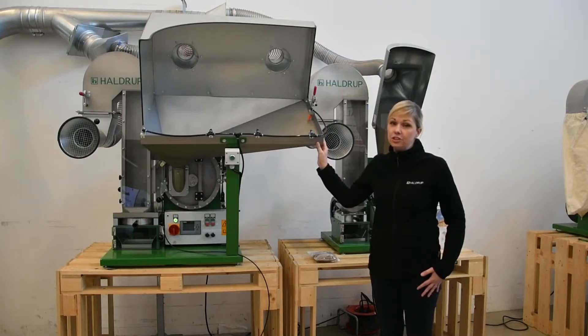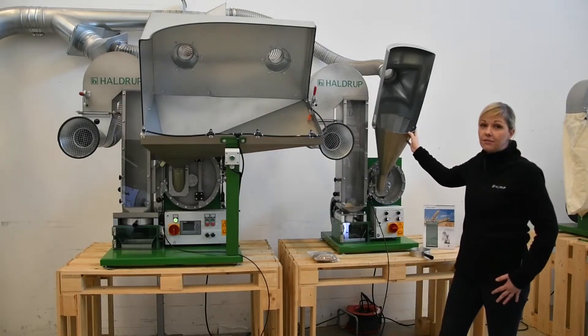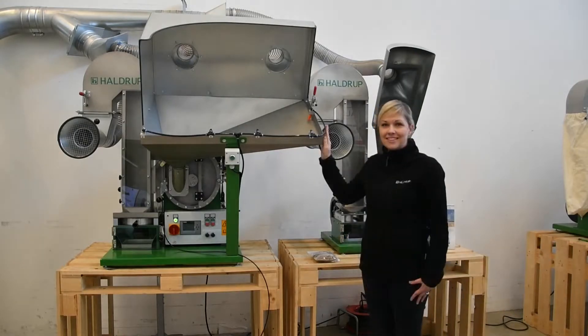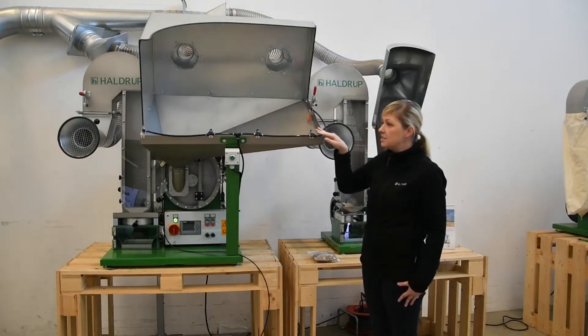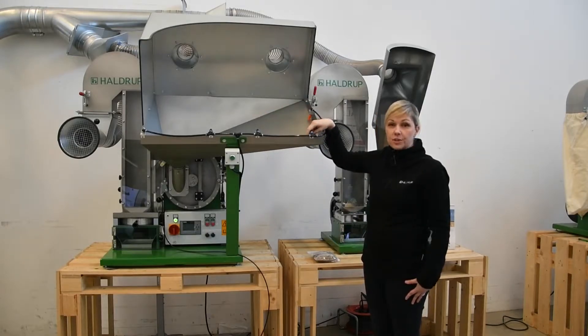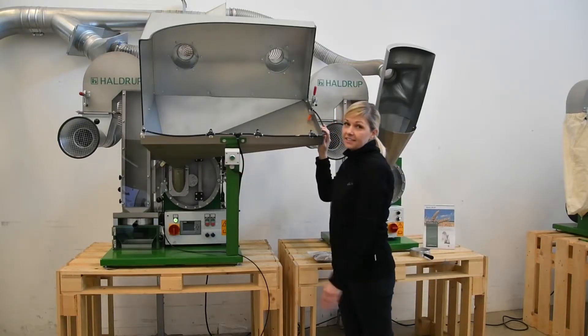It was specially designed for threshing oilseed crops. This feeding funnel can also be very easily dismounted and exchanged, for example, for a smaller round feeding funnel which we have on our HALDRUP LT15. As you can see on this machine, we also offer the possibility to install a cleaning option for the feeding funnel, which can be very easily activated and deactivated.